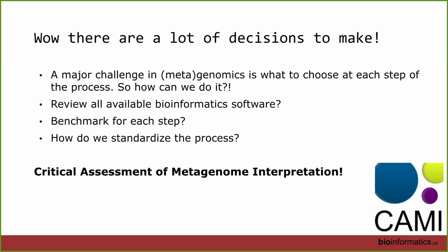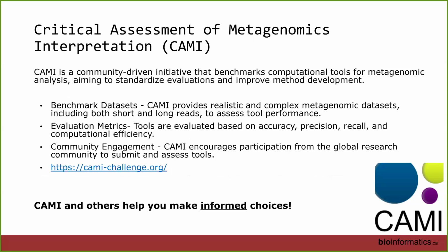There's currently 2 main publications, CAMI 1 and CAMI 2. What they do is they run these challenges. Anybody who has a bioinformatics software can download their challenge data set, run their software on that, whether it be an assembler, a binner, or a taxonomic profiler, and then they collect the output, and then they score and compare all of those different software. And then we get the benefit from seeing how those different software do. And the answer to that is that they vary quite a lot.